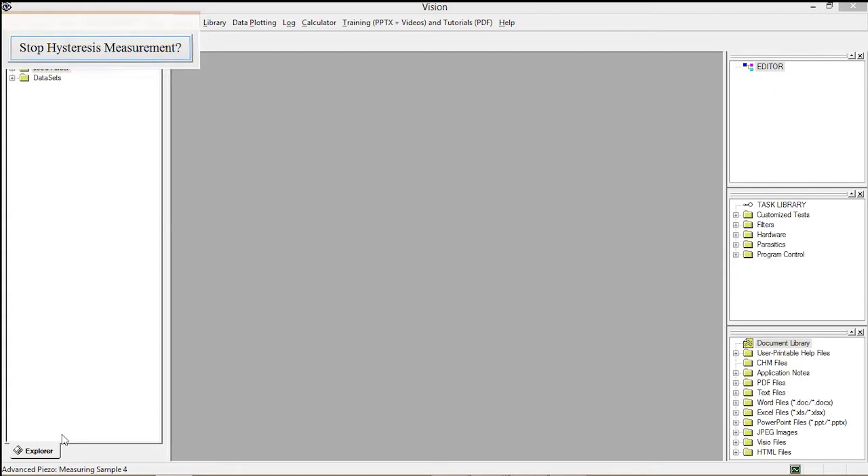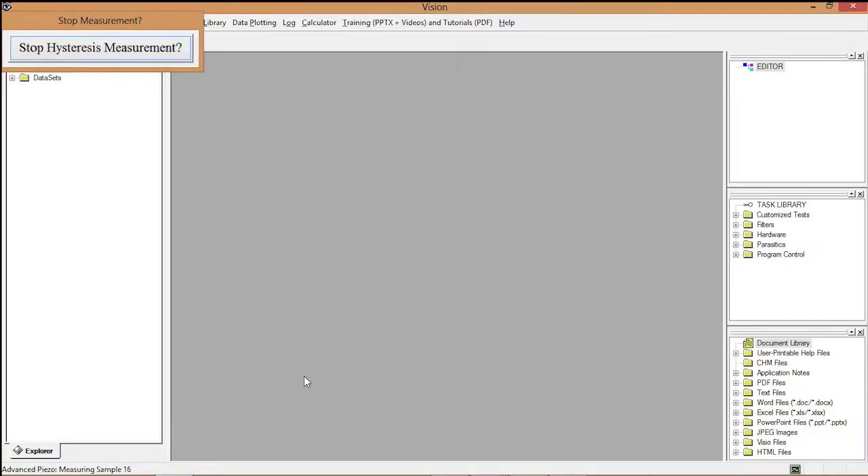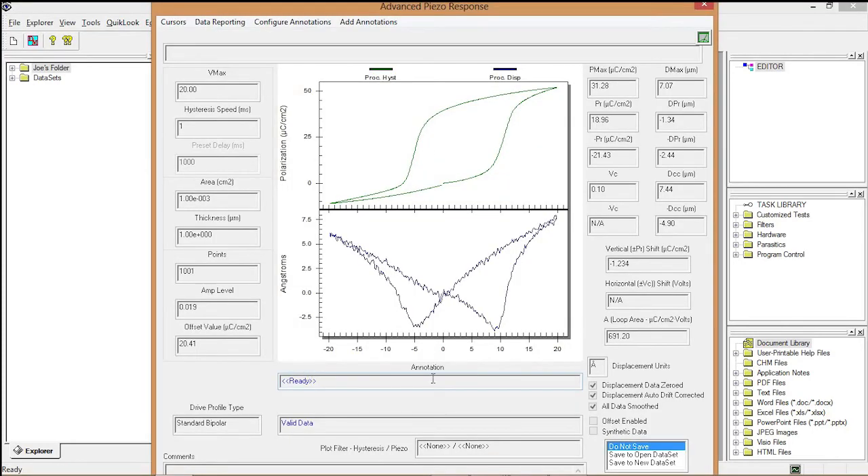I start the Advanced Piezo test. The system is running through 20 measurement loops, displaying progress at the bottom of the Vision window. Notably, even though the cantilever is moving, you cannot see even the speckle from the laser spot because the displacement is so small.